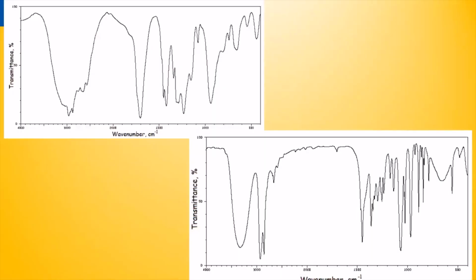Welcome once again. We're going to continue our discussion on interpreting infrared spectrums. I'm going to load these two because this is the first time since I've shown you a spectrum. I just want to take 2 seconds to walk you through the X and the Y axis. The Y axis is the percent transmittance, that is how much radiation is transmitted through the cuvette containing the sample. That's the y-axis. Now wave number is the x-axis.